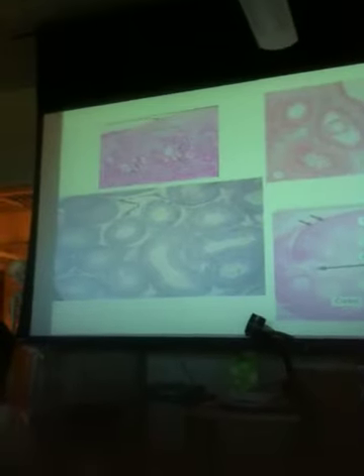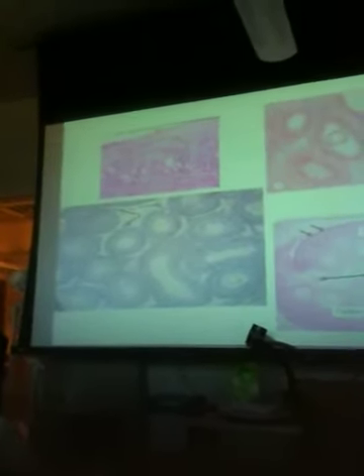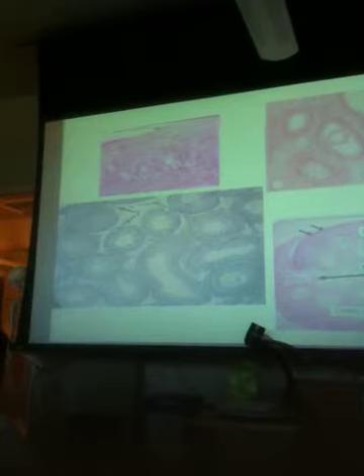Okay, what are you looking at here? Testes. Testes. What are these tubules called? And you've looked at them a couple of times, once in the endocrine system.